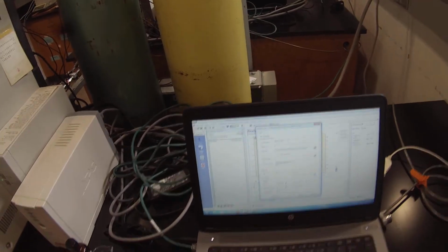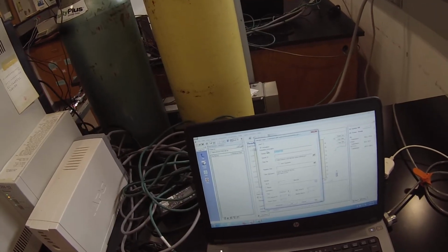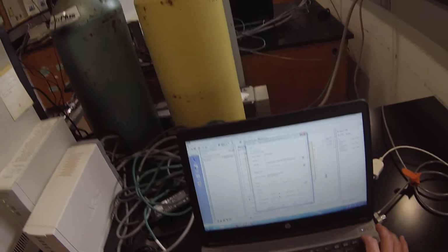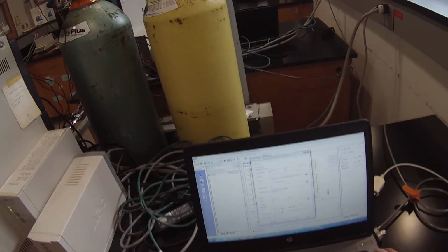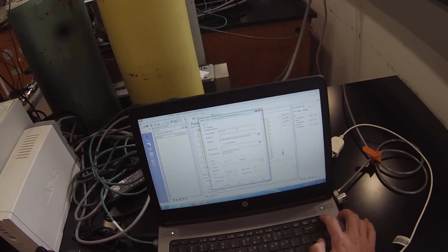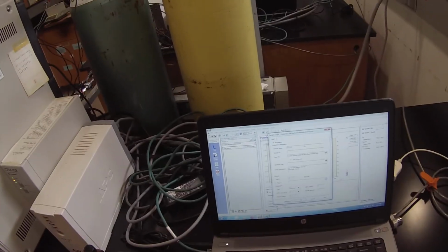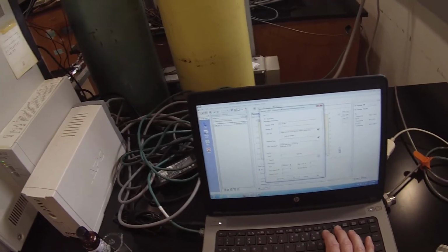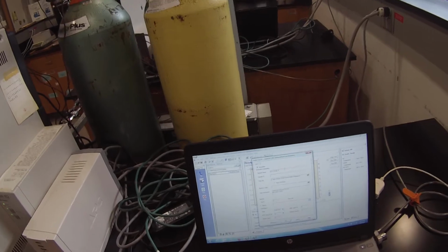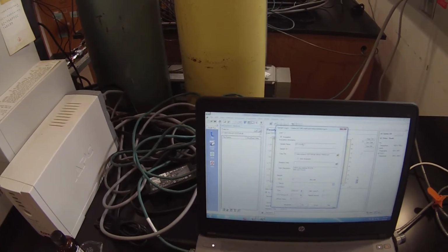There's my file name, and then under sample name, that's where you would put your lot number. I can't remember what page I said I was on, since I'm not actually writing any of this down. So I'm going to call it DCL-10-NBU-1. Right. So this is the first piece of data I've gotten on the n-butyl stuff.